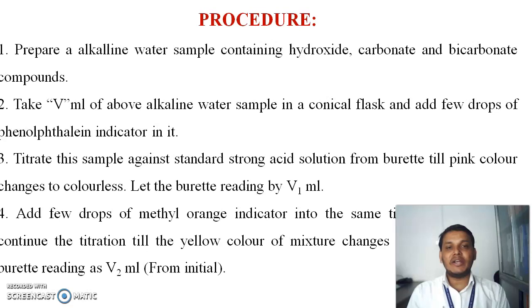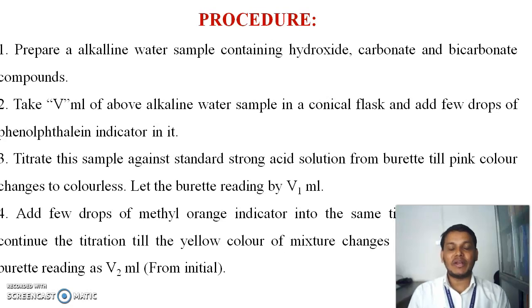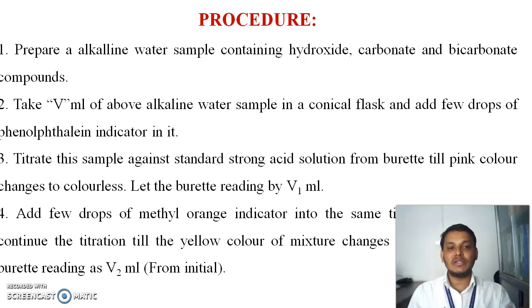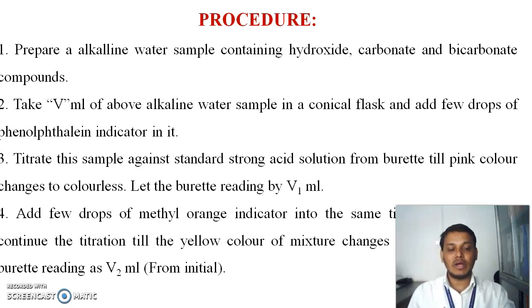To the same conical flask, add 2 to 3 drops of methyl orange indicator — the solution turns yellow. Titrate this yellow solution against the standard acid. The end point is yellow changing to orange-red. Note this burette reading as V2 mL, which is the methyl orange end point representing complete neutralization of hydroxide, carbonate, and bicarbonate.